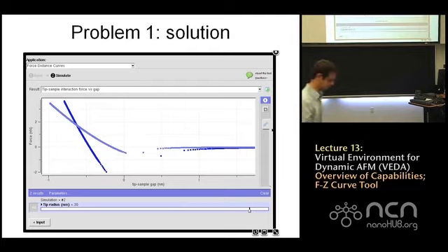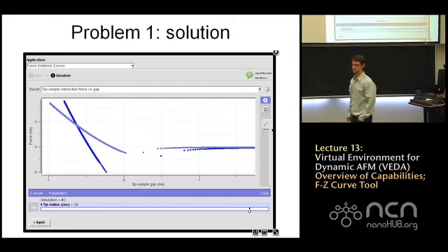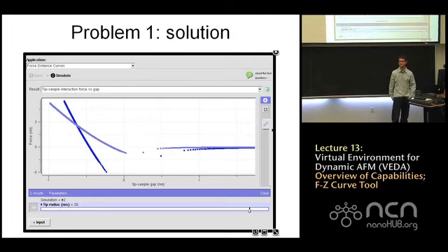So if you auto-calculate the difference, that lines them up somehow. Yeah, basically you've forced the adhesion force to be the same thing in both cases. Then I have to run the simulation again.